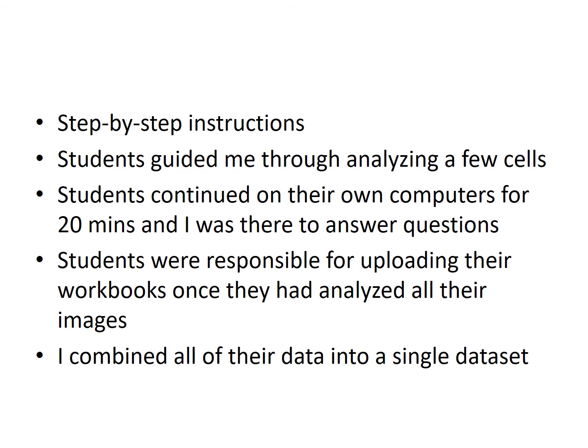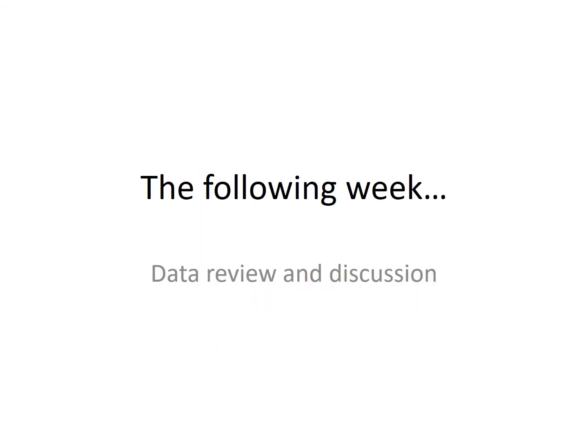And then I kept the Microsoft Teams meeting open, and I had the students continue on their own computers for about 20 minutes, and I was there to answer questions. A few questions did come up. Sometimes they wanted me to verify that they were measuring correctly or counting correctly, and that was fine. After about 20 minutes, it seemed like everybody had settled in. After that, the students were on their own and responsible for uploading their workbooks. And then I combined all of their data into a single data sheet.